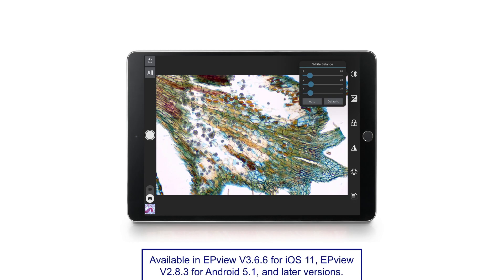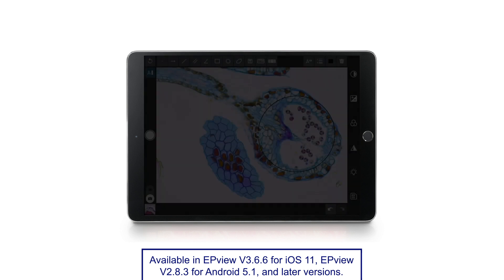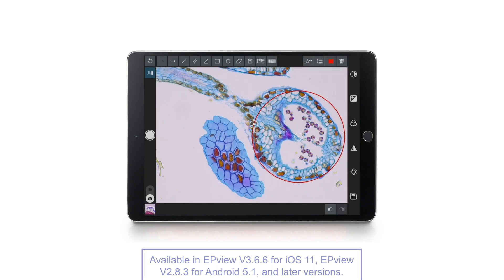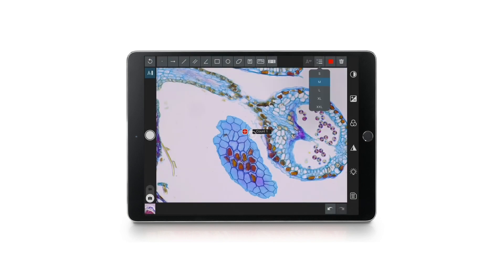Using EP View, you can process, annotate, measure, save, and share the camera's high-quality 5-megapixel images.